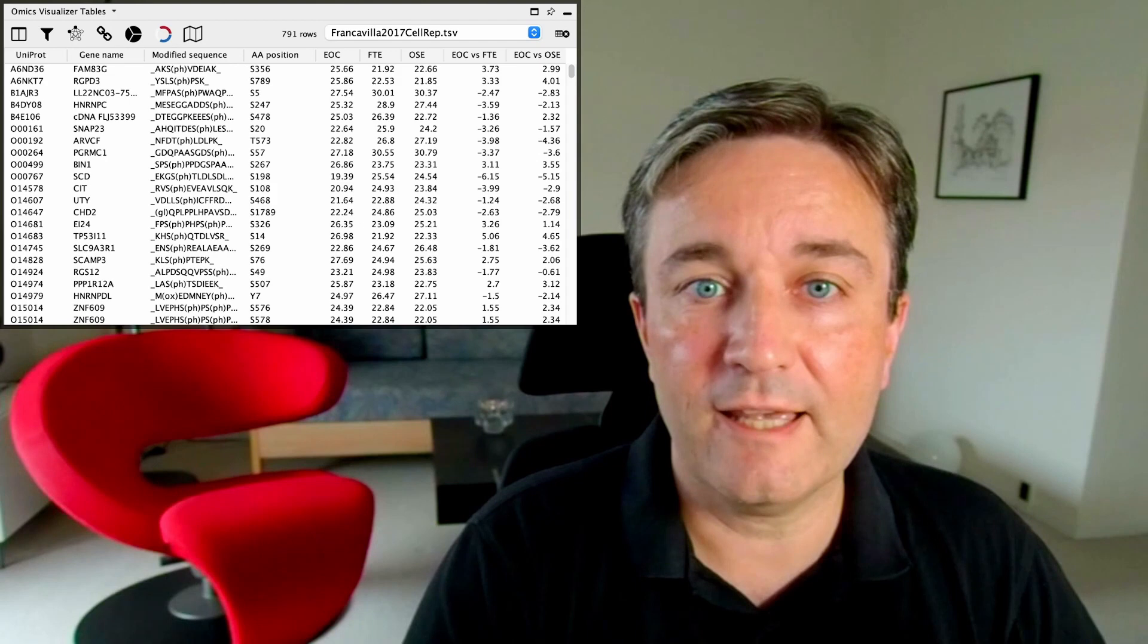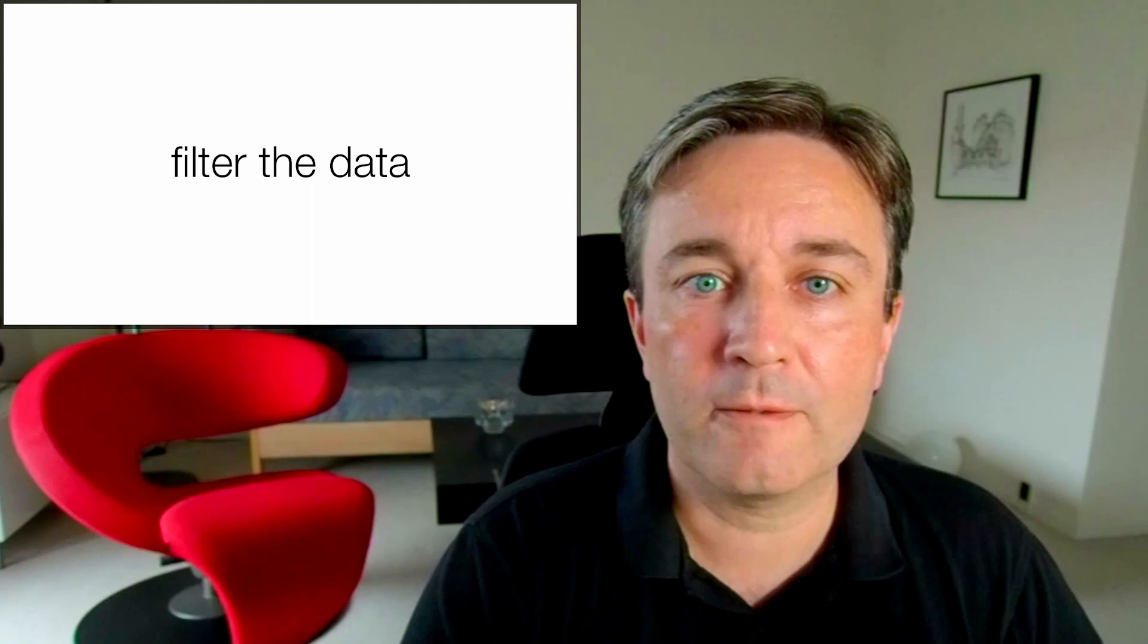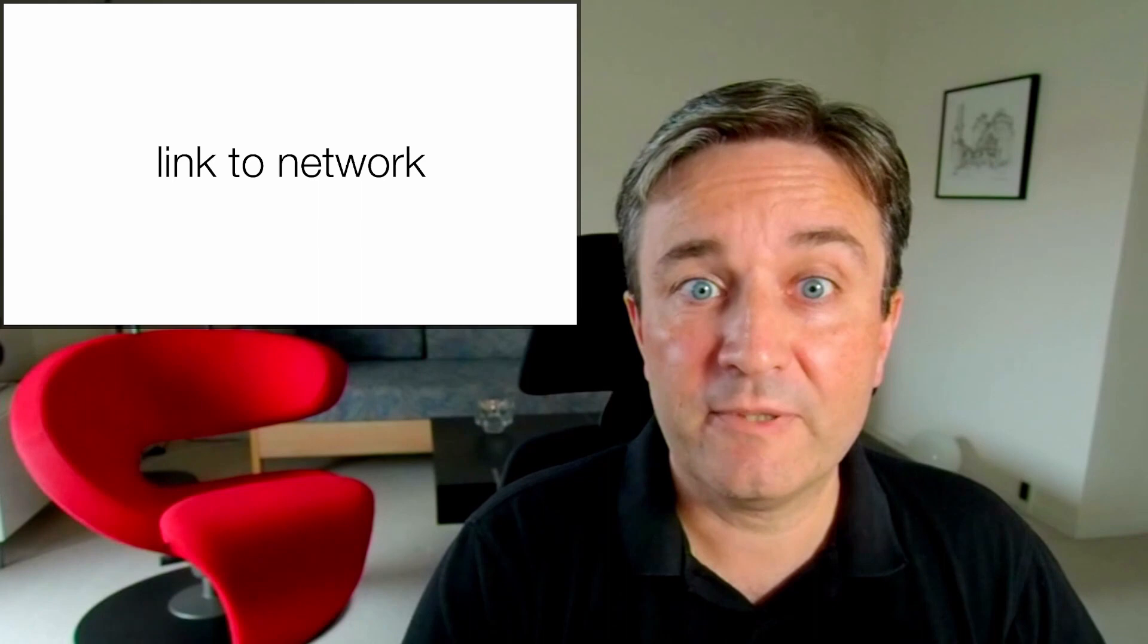Once you've imported the table, you can filter it in various ways, and then either retrieve a string network via the string app, or map the data table to a network that you've imported yourself.